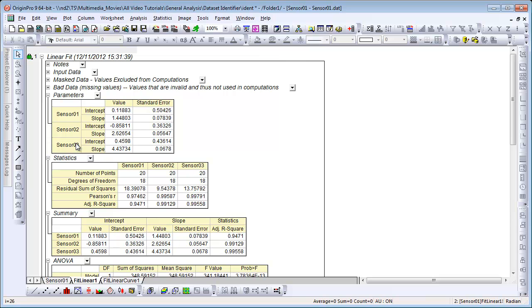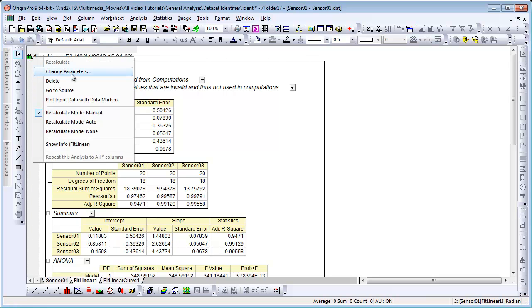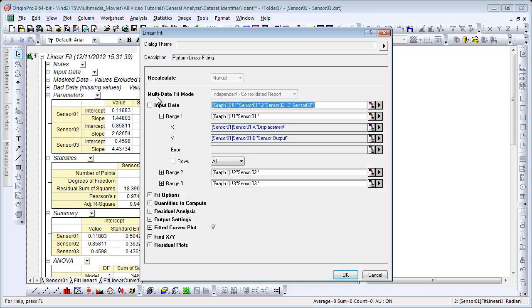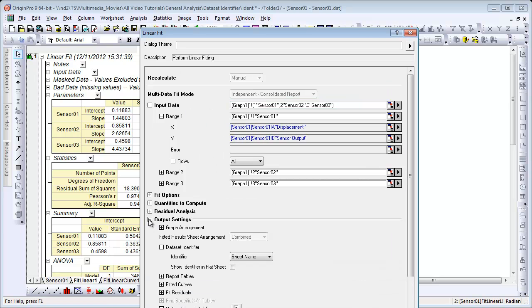Of course, we could have done this from the start, too. So if I were to reopen, I'm going to left-click on the lock and go to Change Parameters. Initially, when I had performed the analysis and the Linear Fit dialog opened, I could have expanded the Output Settings branch, and there's a Dataset Identifier option right here.